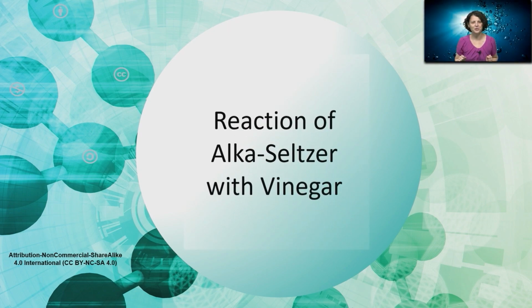My name is Dr. Esther Trufan, and in this video, we're going to explore the reaction between Alka-Seltzer tablets and vinegar. Now, this reaction automatically implies that when we look at the composition of Alka-Seltzer, there is something that is still available to react with vinegar.